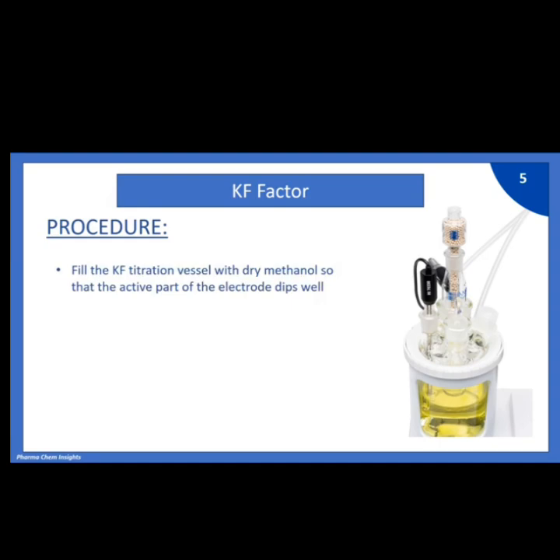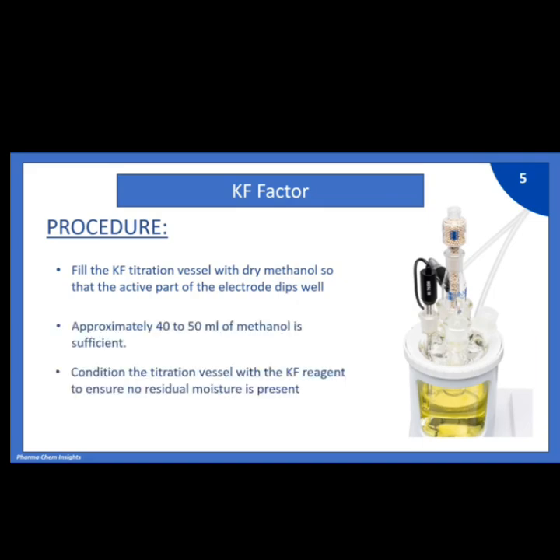Now let's move on to the procedure part. Fill the Kf titration vessel with dried methanol so that the active part of the electrode dips well. Approximately 40 to 50 ml of methanol is sufficient. Condition the titration vessel with the Kf reagent to ensure no residual moisture is present.